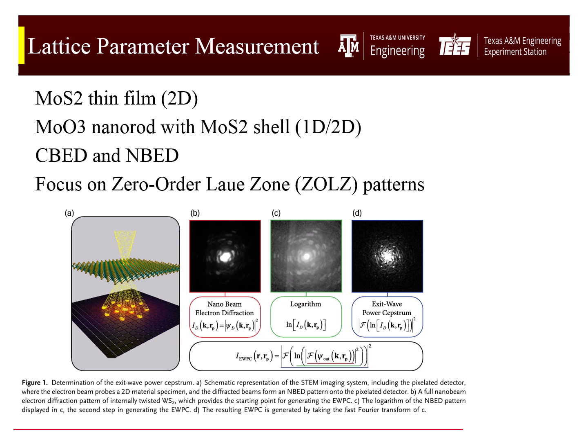Now, an important aspect for strain measurement is obtaining precise lattice parameters. Traditional diffraction methods tend to average over a large area, which washes out fine strain details. Instead, this work used convergent beam electron diffraction under nanobeam electron diffraction conditions. Here, a small electron probe created using a small condenser aperture illuminates the sample and produces a highly localized diffraction pattern. And this pattern, particularly the zero-order Laue zone reflections, is extremely sensitive to small lattice distortions.